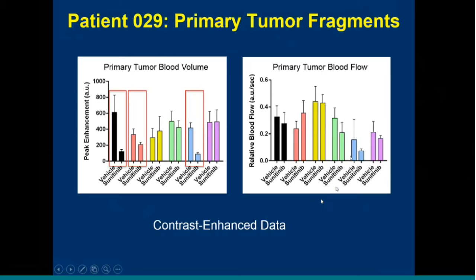A more modern school of thought states that when you dose an anti-angiogenic agent, you're going to get a decrease in blood volume because you're pruning a lot of vessels, but you're also normalizing the network a bit, so you're going to have an increase in tumor blood flow, as you can see in core number 2 here. And generally, vascular normalization is seen as a good thing for anti-angiogenic agents used in conjunction with chemotherapeutics to improve drug dosage, or radiation therapy to improve the production of reactive oxidative species.